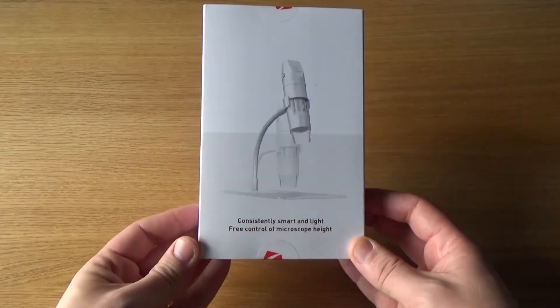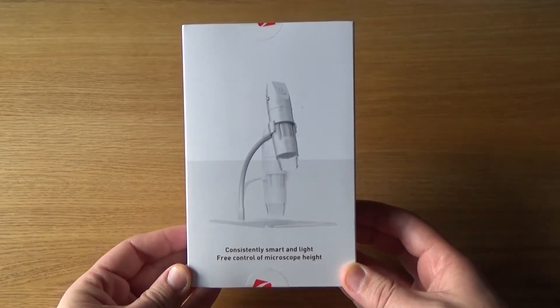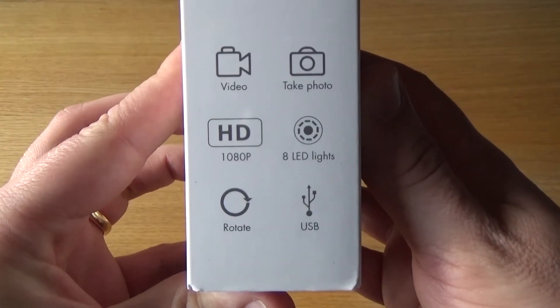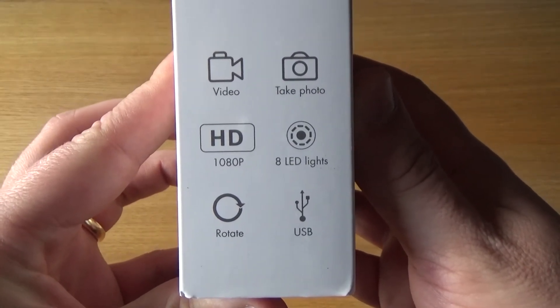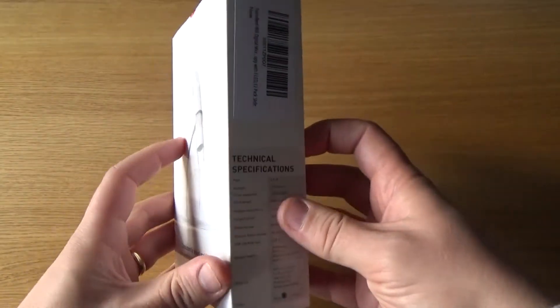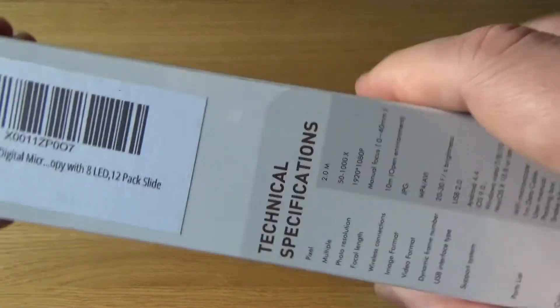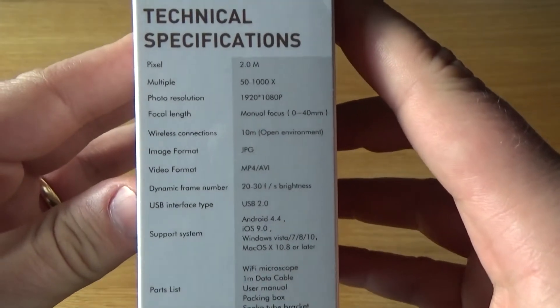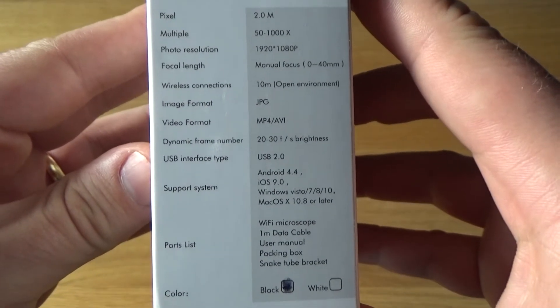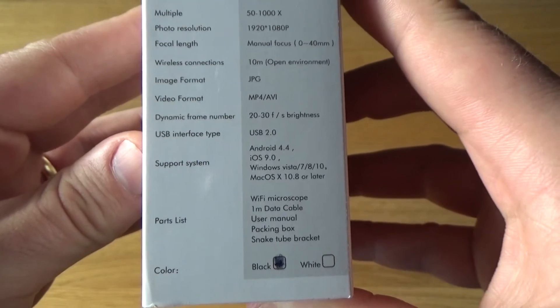It comes in this rather small box, not really branded, and gives you a few specs on the side. It records video, takes photos, and gives out footage in 1080p, has eight LEDs, and connects via USB. However, the 1080p — it actually only has a two megapixel CMOS sensor, so the 1080p is basically an upscaled version of that. It's not fantastic footage, but it's good enough — you'll see it later on when we see the footage that the camera produced.